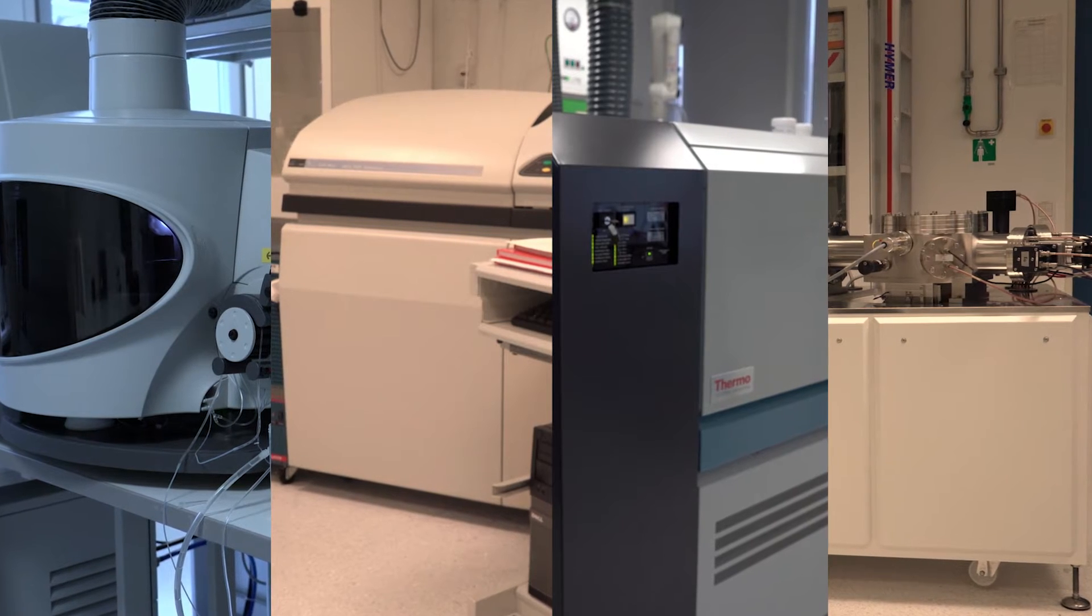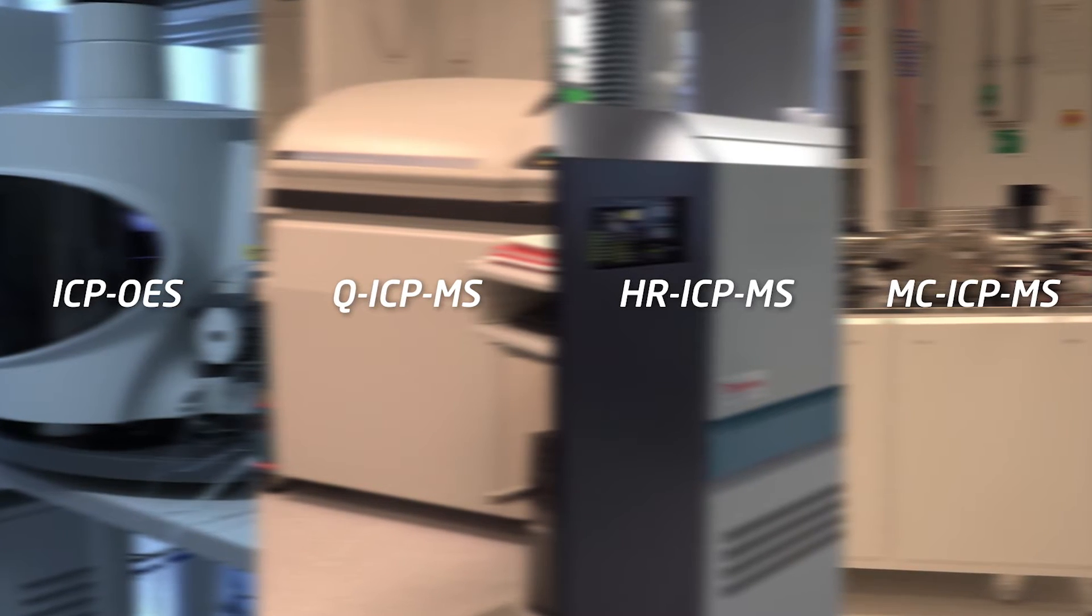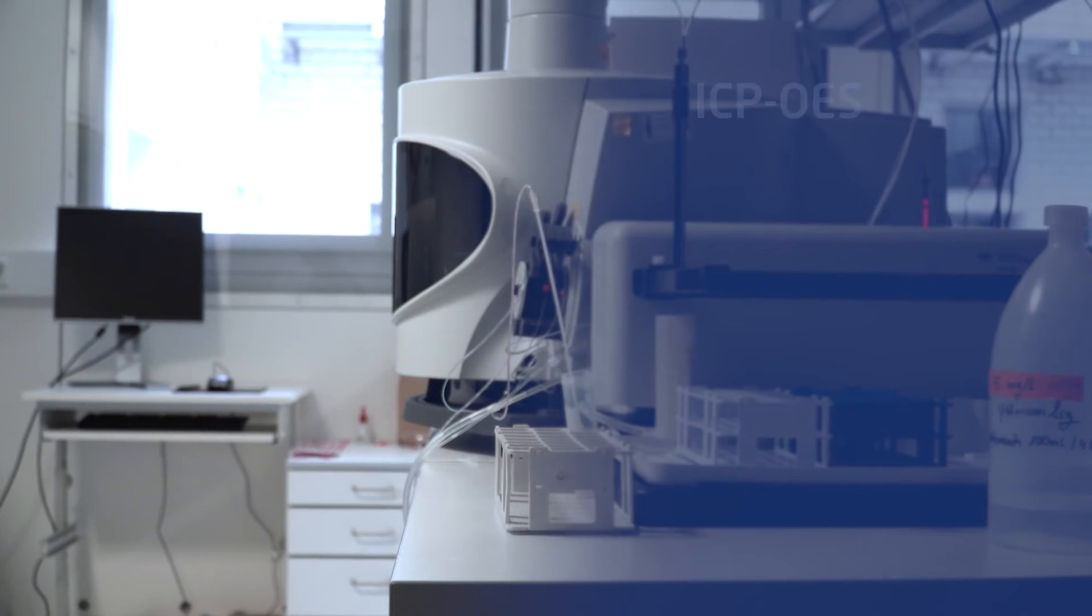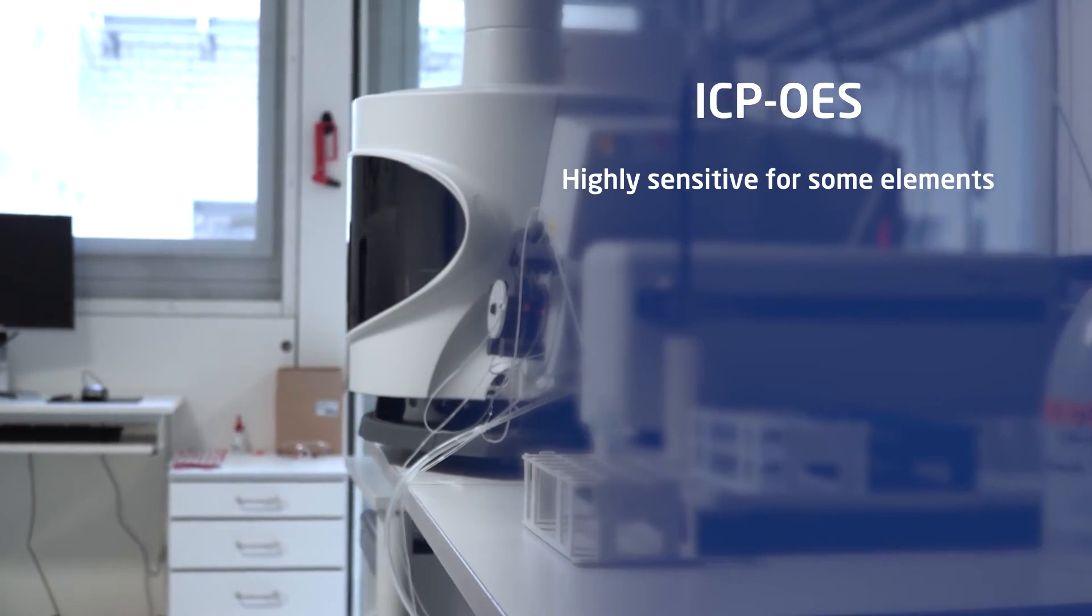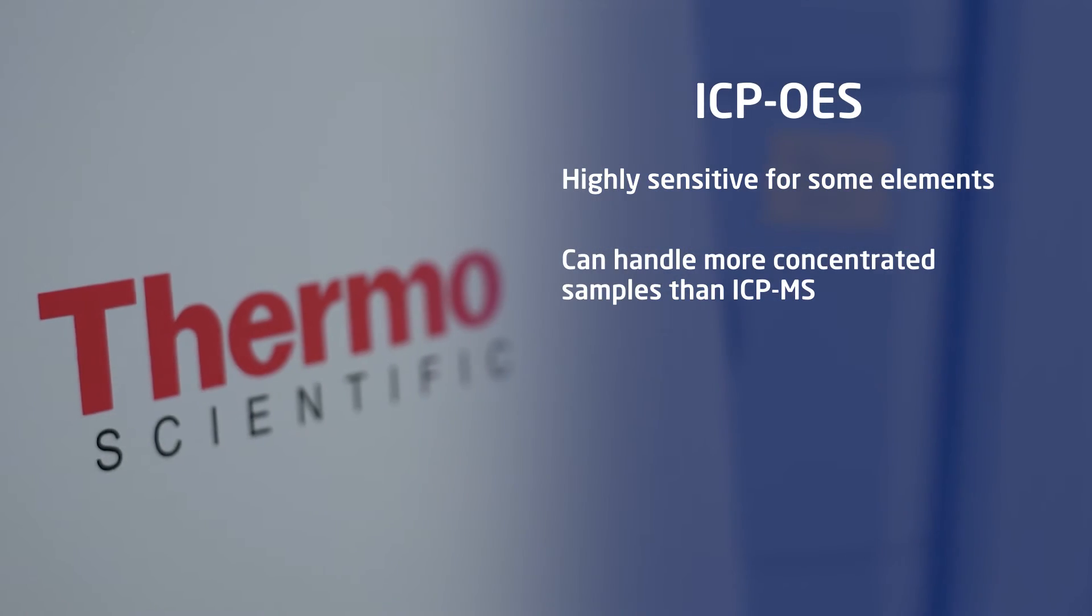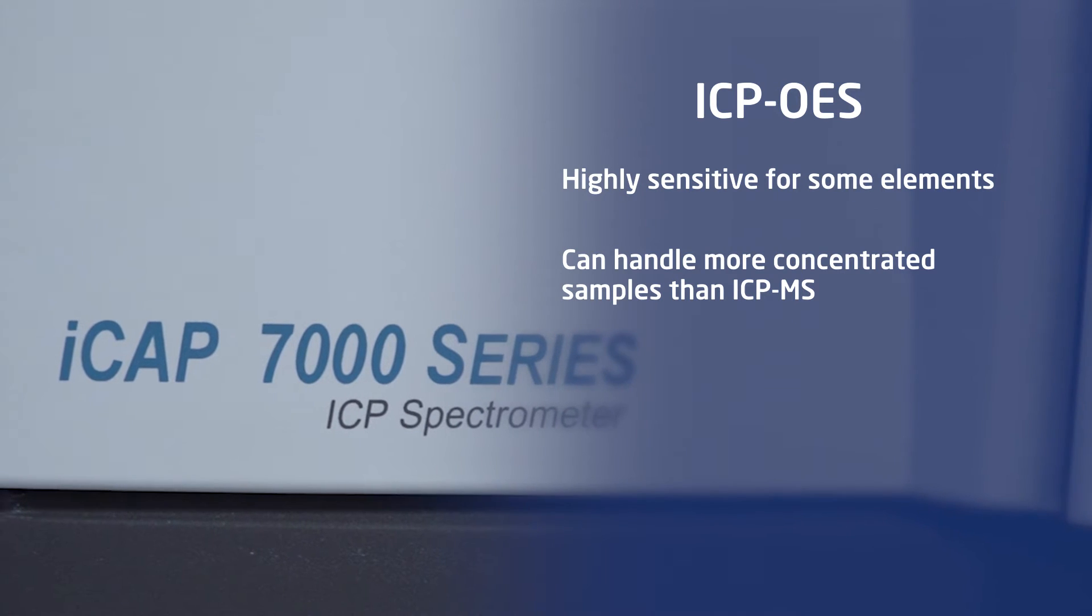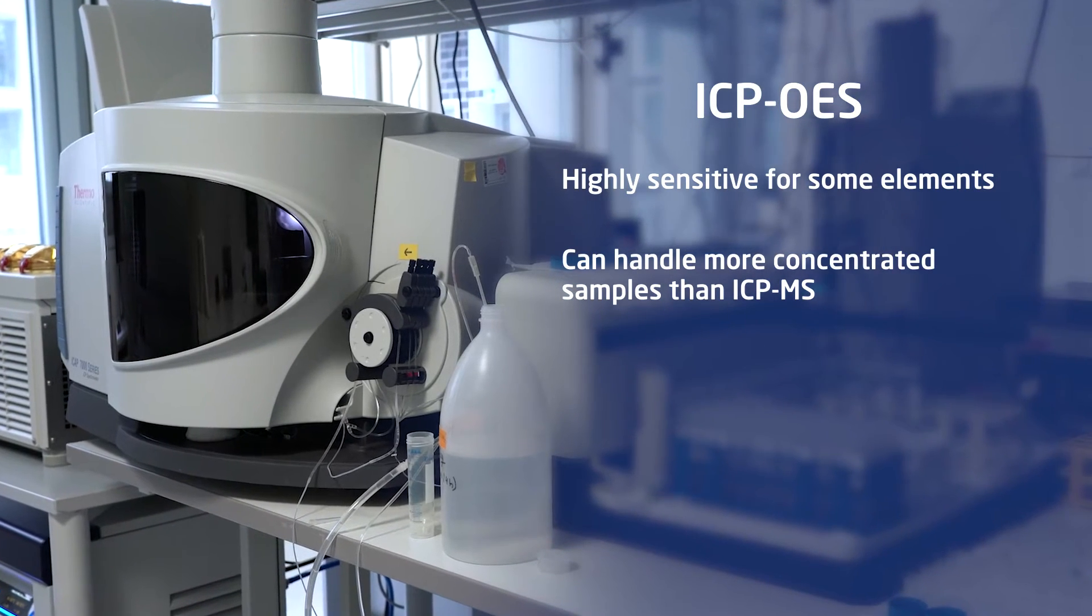In principle, there are four types of ICP instruments. The choice of which instrument to use depends on the elements you are trying to detect and the available resources. The ICP-OES is very sensitive for some elements and can handle more concentrated samples than an ICP-MS and is therefore very useful for the analysis of marine particles.